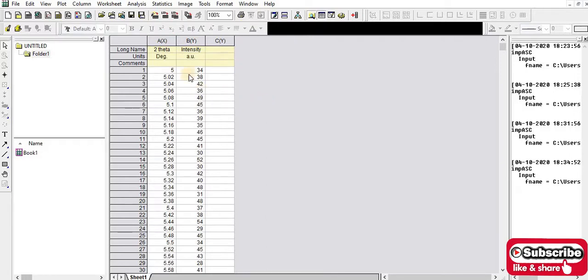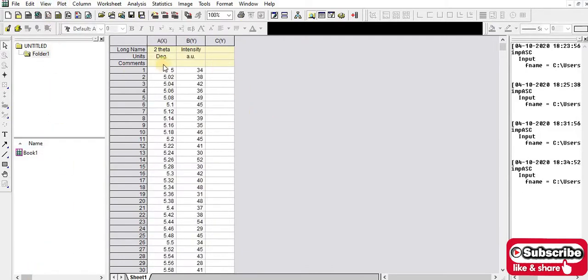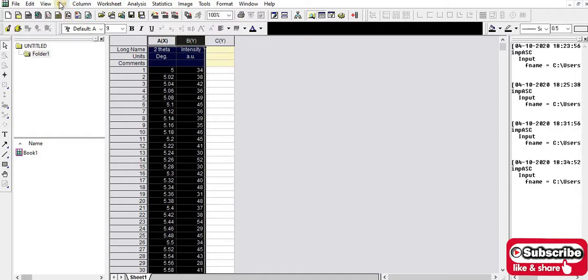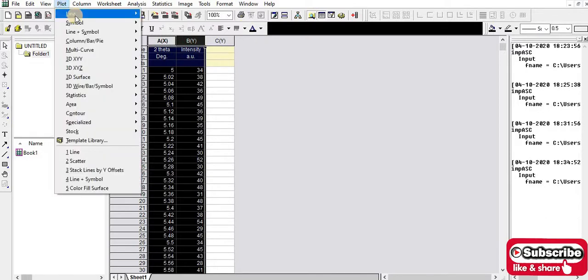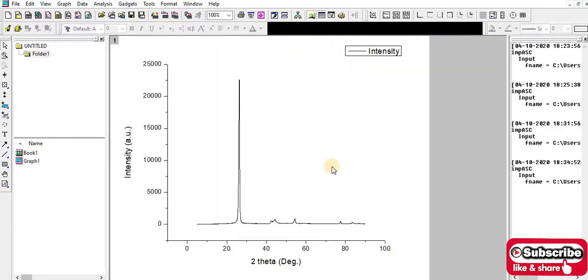So select this, this is my data. If I want to plot, we have to select that part and go to Plot. If I want to plot a line, so line plot, let's see. So this is the data. So how will I change this graph to a particular form, I mean to make this graph proper, by changing different parameters.